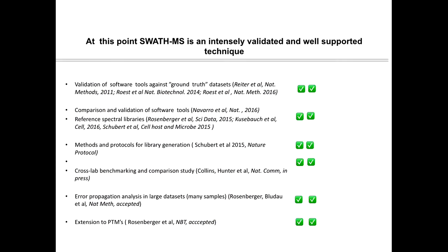Okay. So to summarize this part, I think that right now the technique you learned this week is an intensely validated and well-supported mass spectrometric technique, and it has been benchmarked and validated in the acquisition. It has been benchmarked at the level of the software tools, and it has also been benchmarked against ground truth, against manually curated data sets.